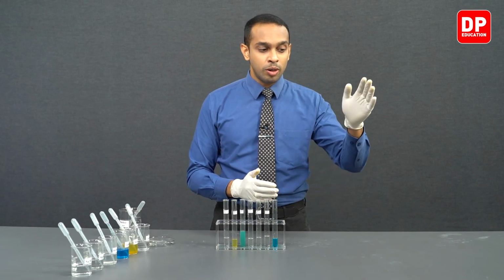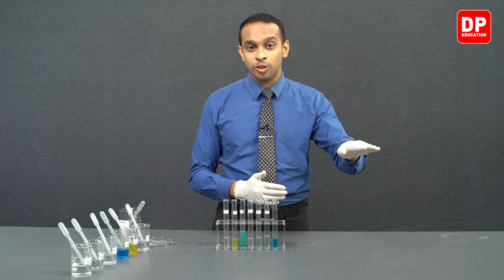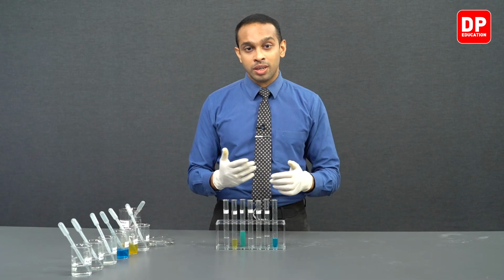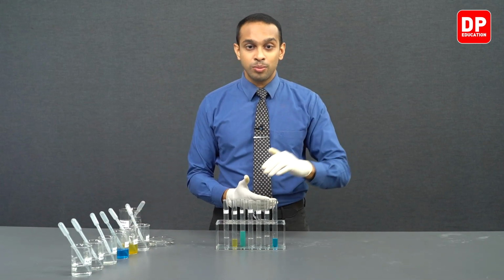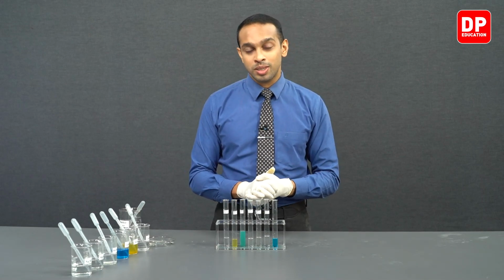So in this case, as copper 2 plus turns into copper solid, the concentration of copper 2 plus ions in the medium will decrease. Therefore, the color of the medium will also change from a very clear blue color to a pale blue or very light blue color when the copper 2 plus ion concentration drops in the medium.